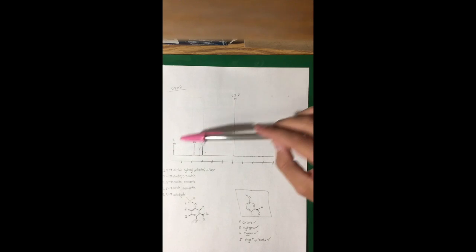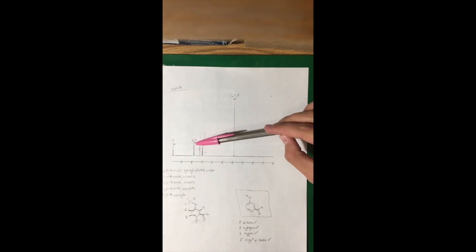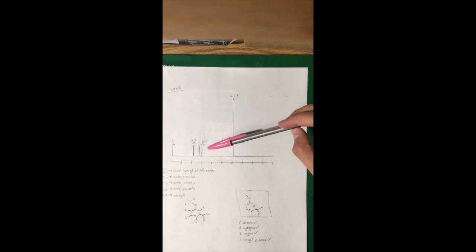Next, we look into proton NMR. First we look at these peaks and the integration numbers. We have 1 hydrogen here. This peak integrates to 2 hydrogens. Again, this one integrates to 2. And then finally, the last peak integrates to 3 hydrogens.